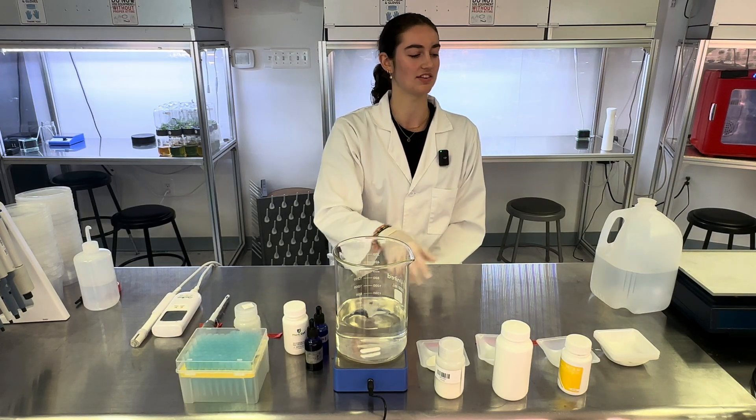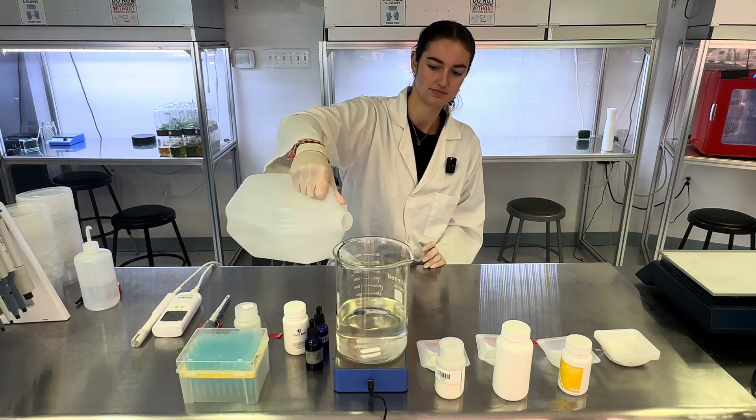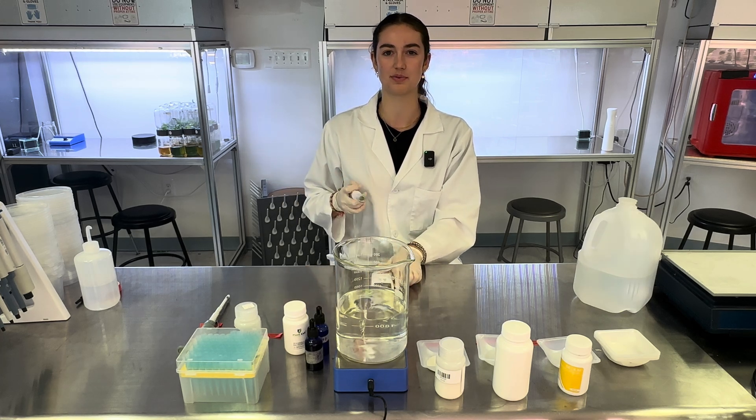Turn off your magnetic stirrer and add the rest of the water to the 1,000 milliliter mark. Now, using your pH meter, calibrate the pH to 5.8.